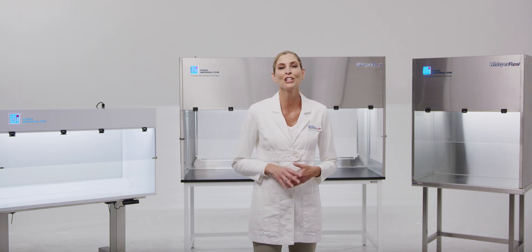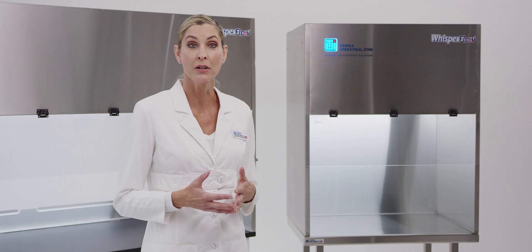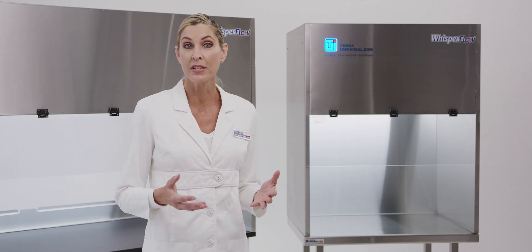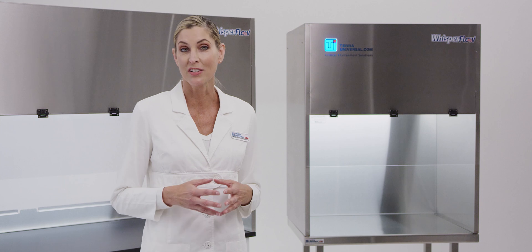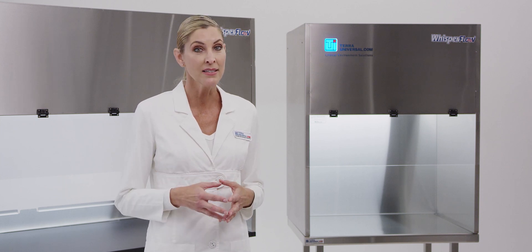Let's take a look at three popular benchtop models. Terra's BioSafe WhisperFlow Benchtop Vertical Laminar Flow Hoods maintain an ISO class 4 environment for sterile aseptic sample processing. The turnkey system includes the hood frame, adjustable speed blower, HEPA filter, LED light, and status indicator.